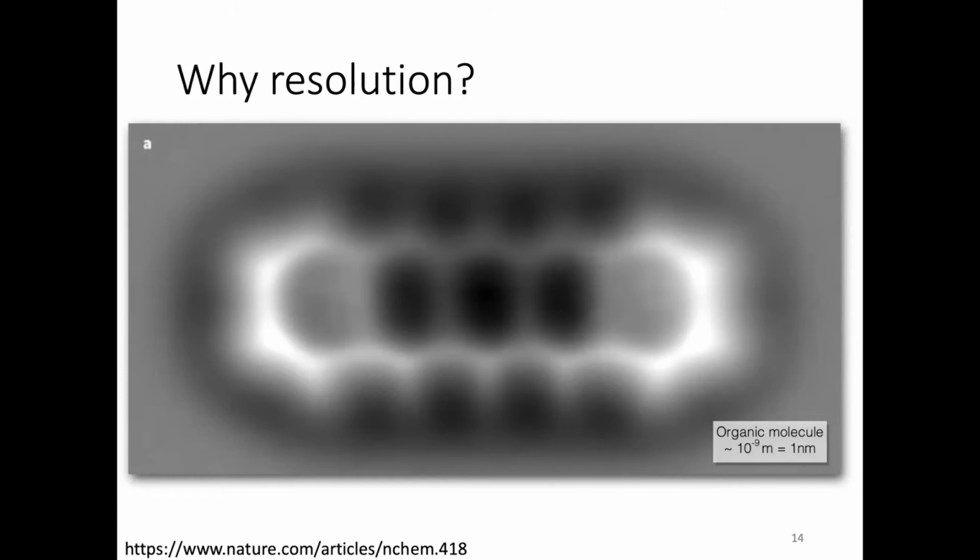For example, we're not going to talk about that today, but using cryo-electron microscopy, people are now solving single protein structures, which before was only done with, for example, X-ray crystallography. So the detectors are becoming super good. The software to analyze those images is becoming increasingly good. And therefore, we're reaching higher and higher resolutions so we can actually see single molecule level events.